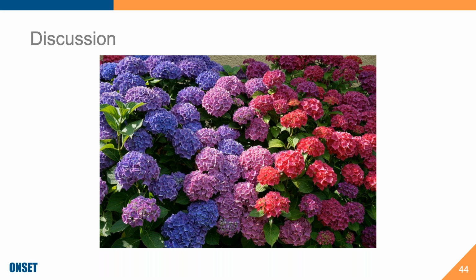Our loggers specifically mitigate differences in temperature, but it's just a good idea to definitely calibrate at the same temperature that your sample is. If you calibrate to that temperature and you're within, I think, plus or minus 10 degrees Celsius, or actually plus or minus 20 degrees Celsius, maybe, the calibration is still acceptable. So if you calibrated it at, for instance, 25 degrees Celsius and your sample is 35 degrees Celsius down to 15 degrees Celsius, then that calibration should hold pretty well in terms of accuracy.